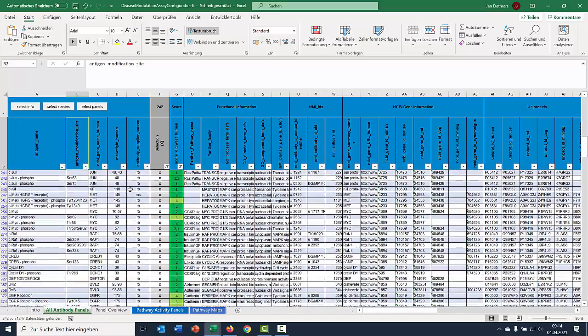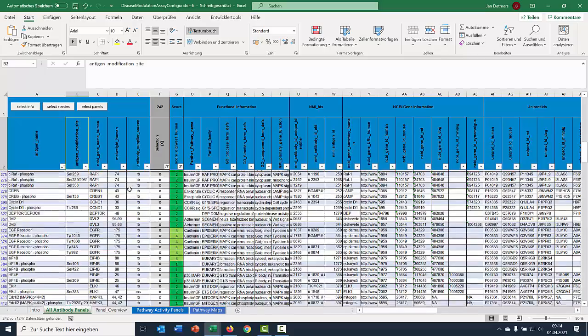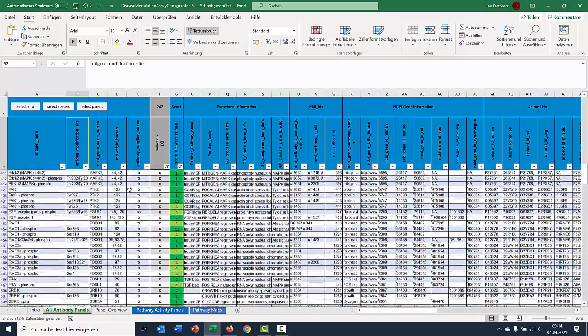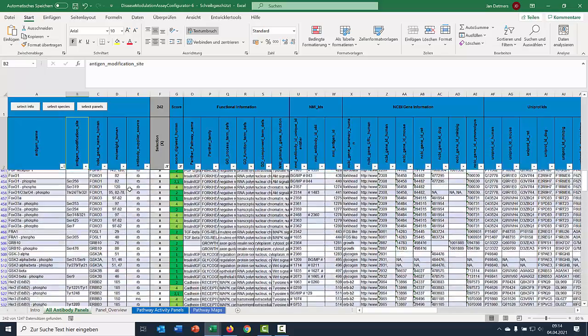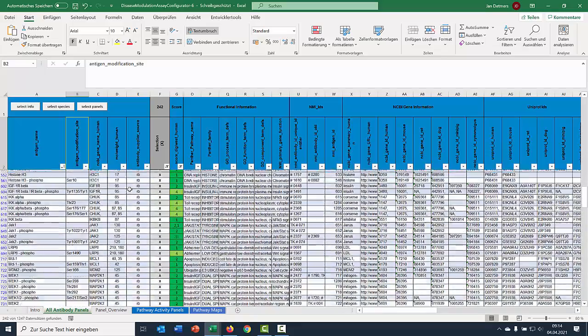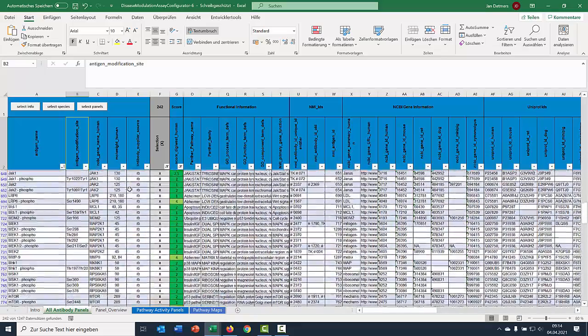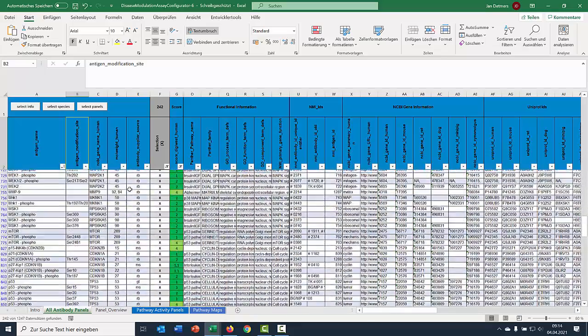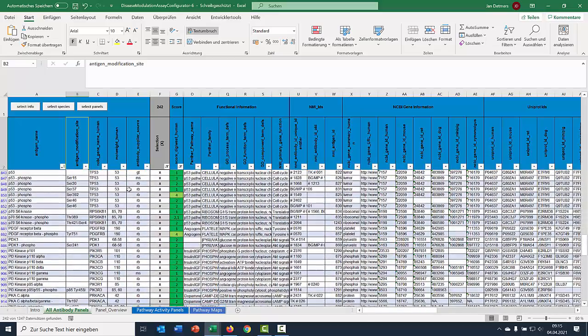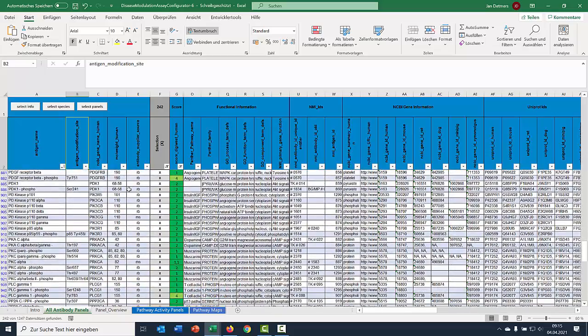The Hyperplex platform helps you quantify target interactions, pathway modulation and disease modulation. Does your drug candidate interact with the target? What are the downstream consequences of the drug-target interaction? Within 2 weeks of sample receipt, AssayEngineers Service Laboratory will provide you with a comprehensive, actionable overview of the relevant activated markers and pathways.